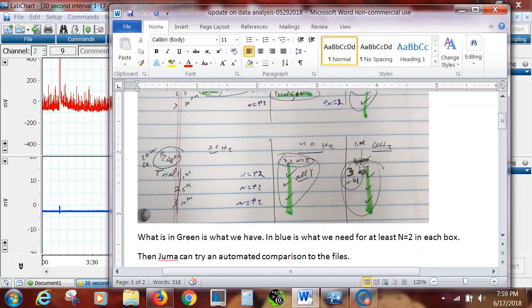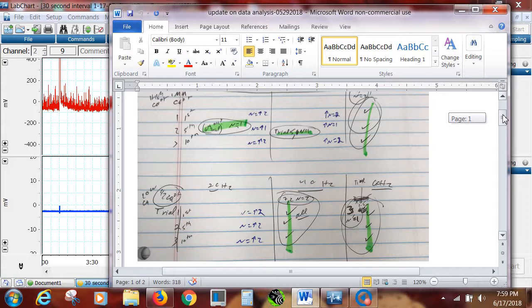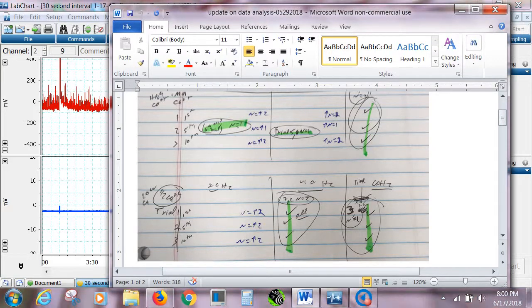All right, and then we already have all of these done and all of these done, so we're going to try to get these to be done. And I'll help out as well. So whatever you think a quantal event is, try to stay with it, and we'll try to assign some groups to this one, this one, and this one, maybe 2 people, so we have 2 different counts, and we'll compare those together, and then we'll get people involved here too.